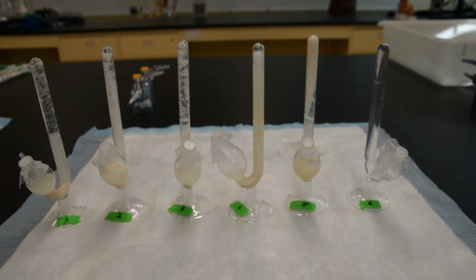So what I'm going to do is I'm going to do the experiment again without the camera, and I'll be more careful and less sloppy. Obviously the way I filled them, I should have added the yeast last so that nothing started before we got going, and add each of the ingredients if repeated to the different tubes. So I'm going to do that. I'm going to make a number of new recordings, and we're going to be sending you the data so that you can graph it and start to answer questions about this process.